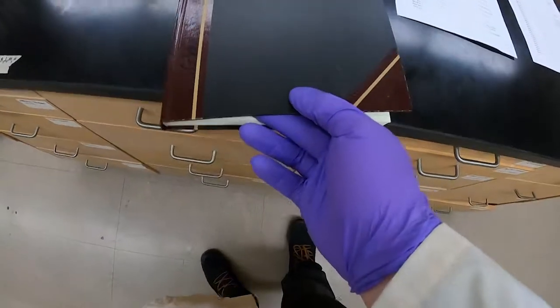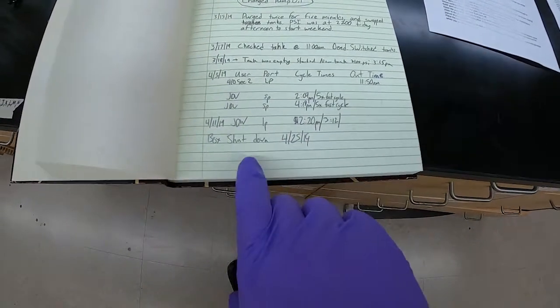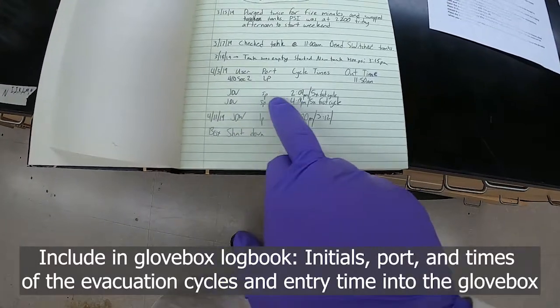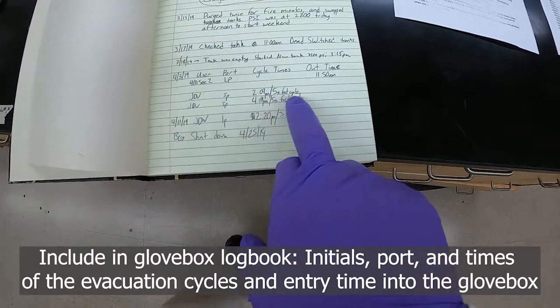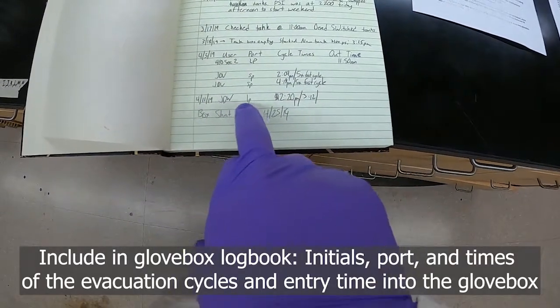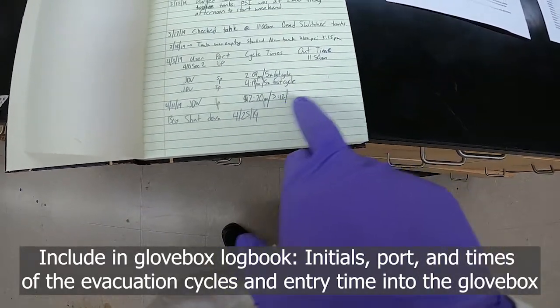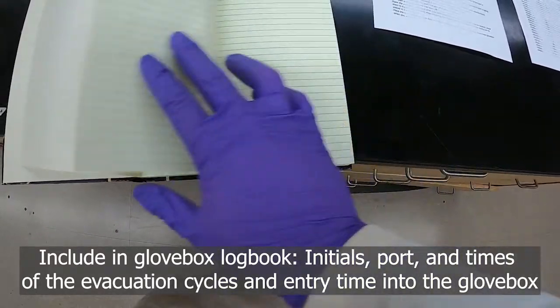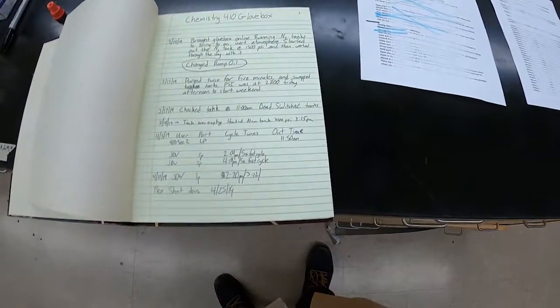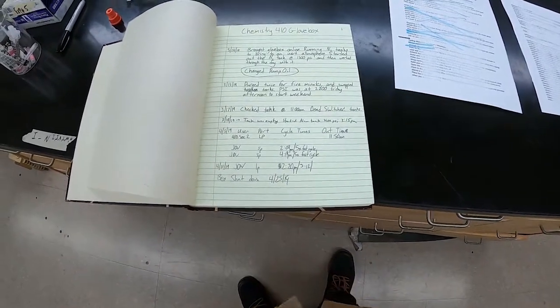Here is the glove box logbook. You can see an example of entries: the initials of the person, which port was used — small port for fast cycles to bring in solvent, for instance. For a large port entry, you record the start time and end time, recording your entries each time you begin an evacuation cycle.